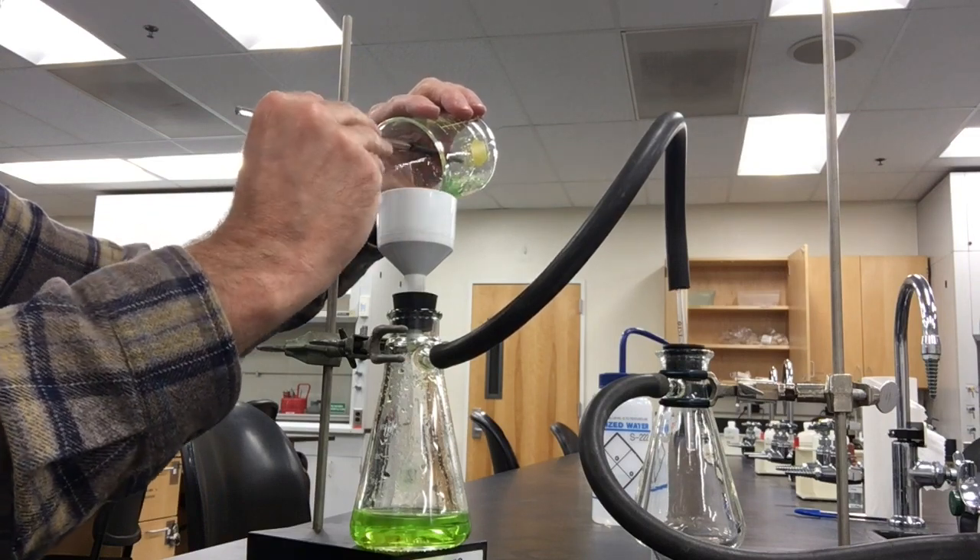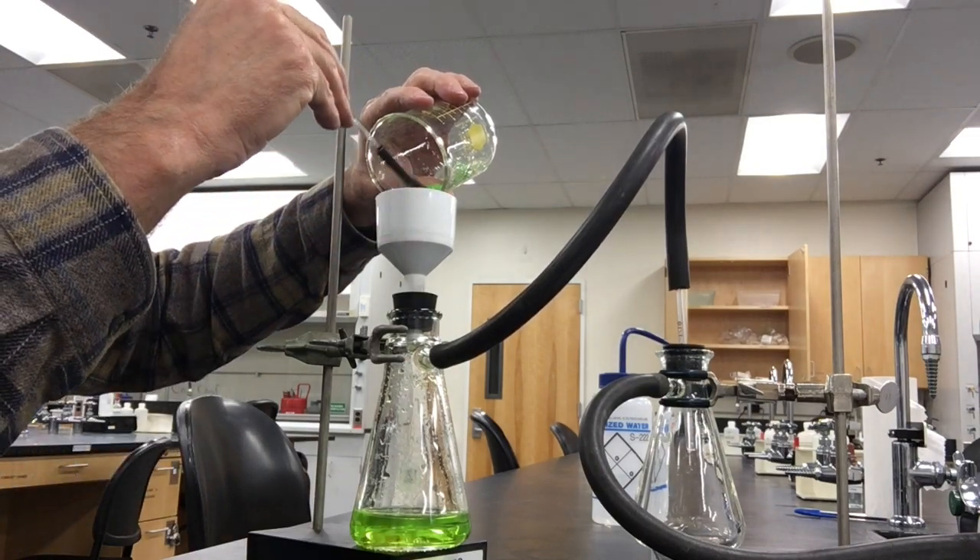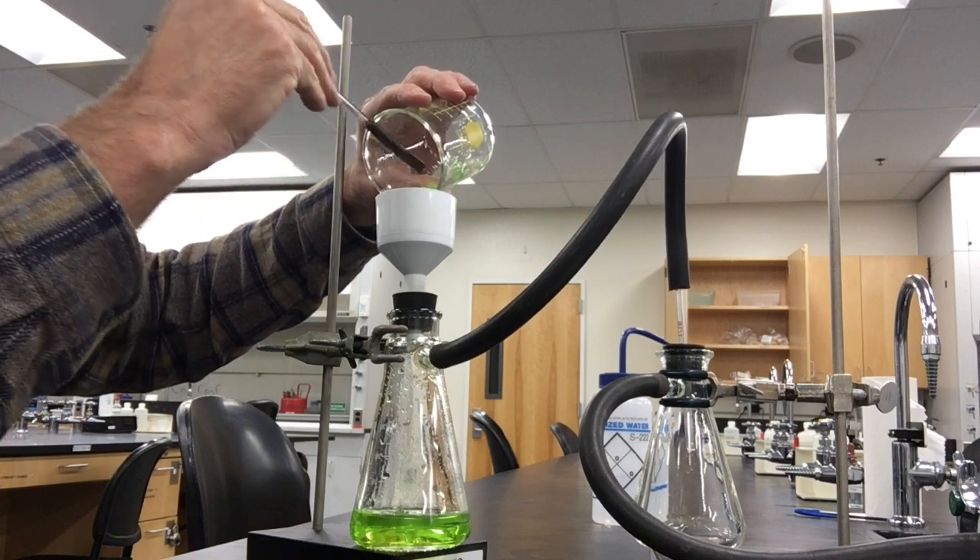Then I want to dry them and weigh them, and then you'll be able to do your calculations and finish the experiment.